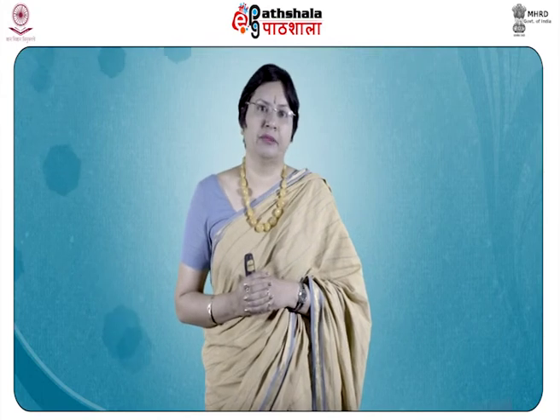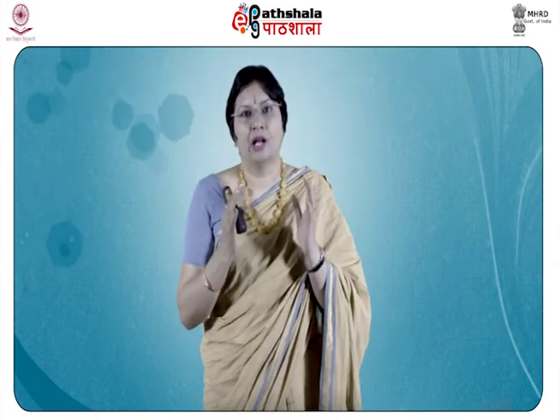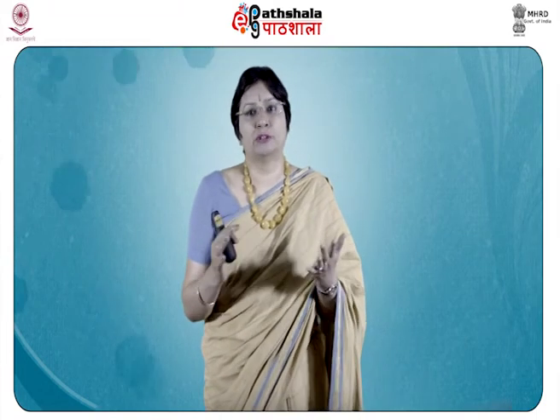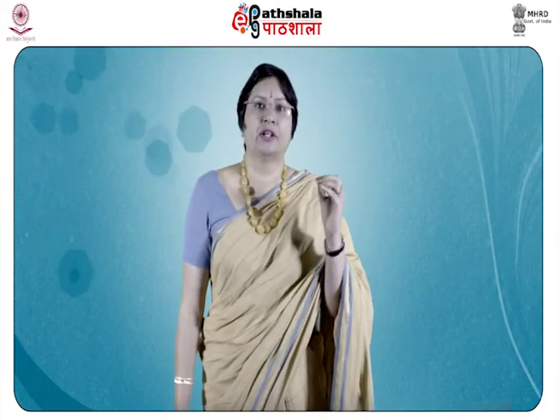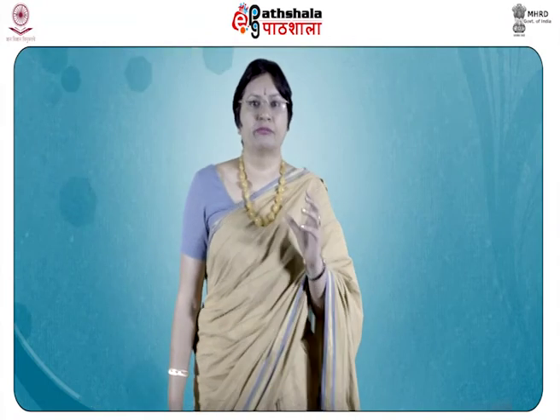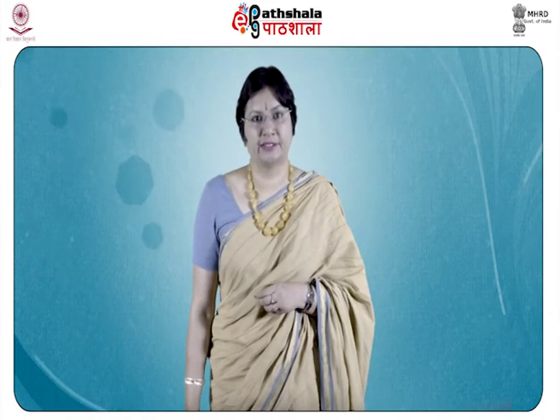In addition, we also studied how the flame test for sodium, potassium, calcium, barium, strontium gives the corresponding color in flame: golden yellow for sodium, violet for potassium, crimson for strontium and so on for detecting these cations.